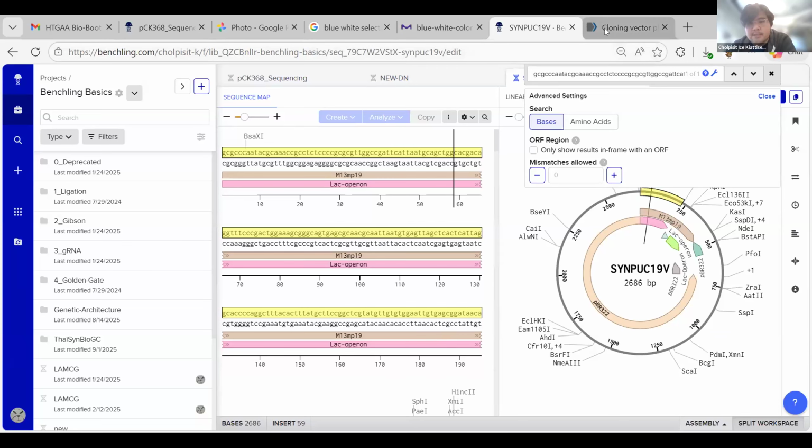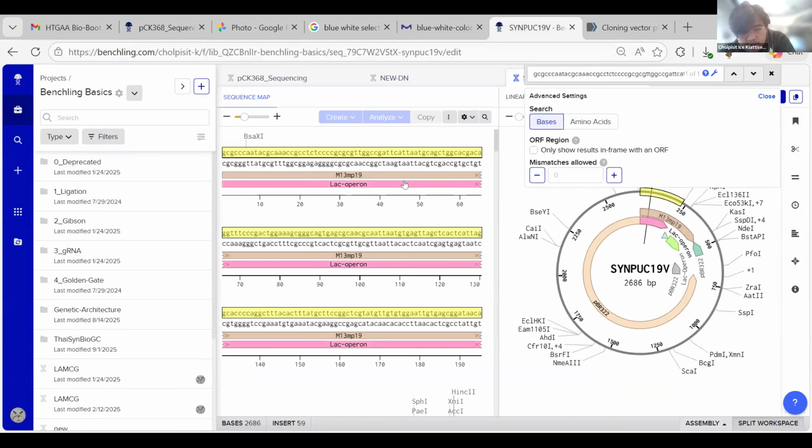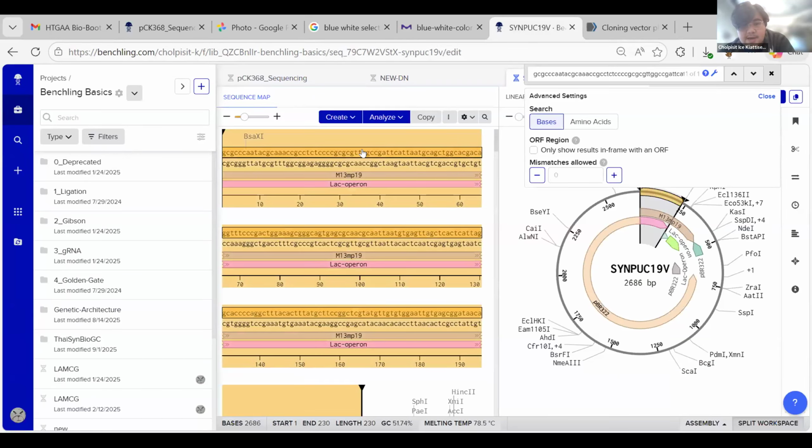If you try to paste this information elsewhere, let's say pop it right here, it's going to be just a string of ATGC threading together. Again, it's very important that we have the annotation process, right? Because if you were asked to look at this sequence and try to interpret what it is, it's going to be pretty difficult for human eyes to distinguish the key differences in this information. So having a computer help us match the information is going to be pretty important and convenient.